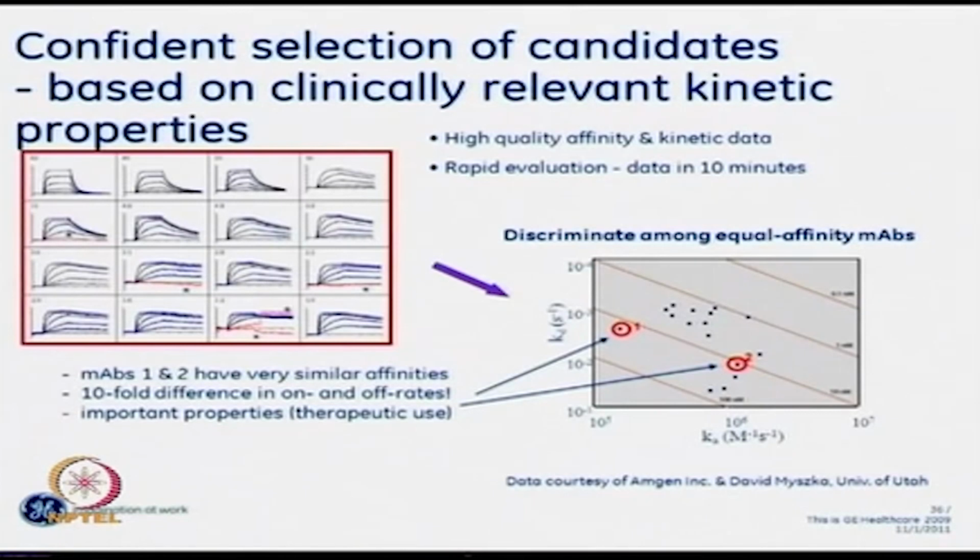So this is a live example of where kinetics data is actually being used to capture information regarding K on and K off and then make a more educated, knowledgeable decision on which MAB to go forward with. I think it's very interesting to see this because you will feel that if you just rely totally on the KD values, if you do not go individually to the K on and K off. Yes, so distribute that KD value into K on and K off and make a more knowledgeable decision. So it was a very interesting example to appreciate the power of kinetic analysis.